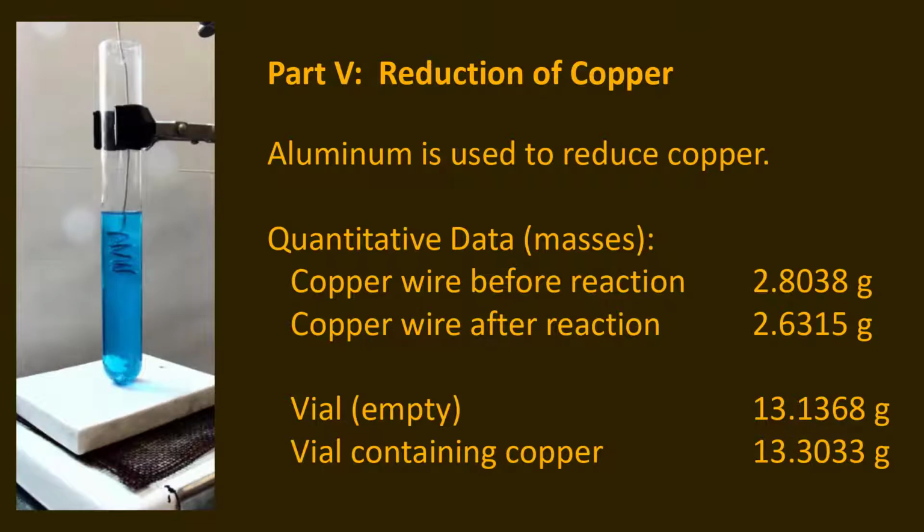The glycine is still going to serve as a great internal indicator, because what happens is that over the course of this chemical reaction, all that excess acid that I added is going to end up reacting with the aluminum surface. So I got the acidity very high by adding that couple of pipettes full of acid. And now that extremely acidic solution is going to be reacting with the aluminum wire.